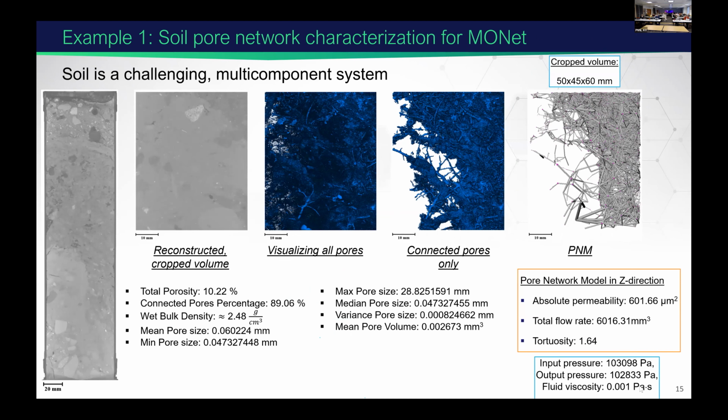So a few examples of using CT data or application of CT. One is MONet. Obviously, this is an actual MONet core showing the image data and the numerical data we provide for the project. We can visualize with the full CT, the full height CT, the different soil horizons, and the kind of a soil texture.